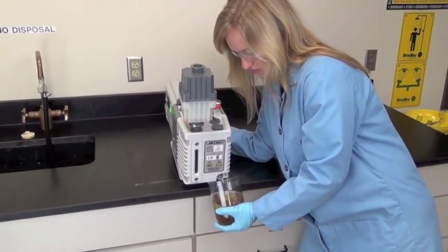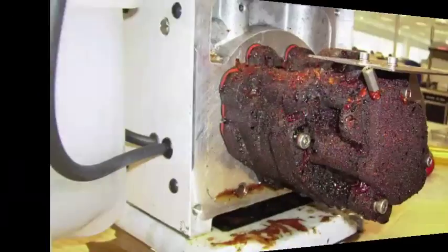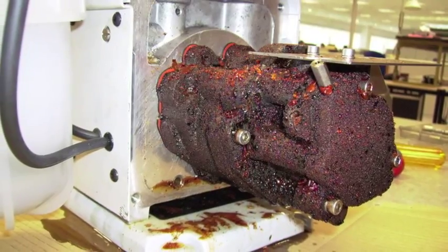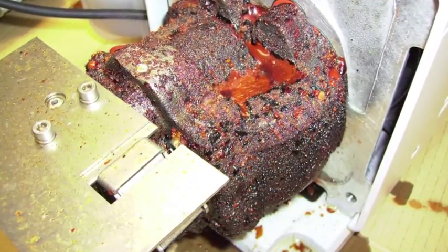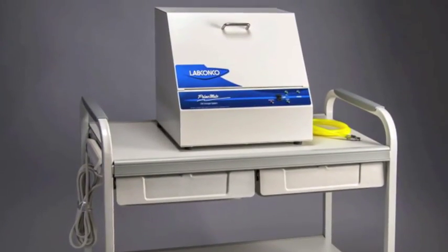Oil changes are a necessity when using a rotary vane pump. Not doing them results in less than optimum vacuum conditions and eventually destroying a vacuum pump. Lab Conco's Primemate oil change system does a complete oil change in as little as 13 minutes with no mess.